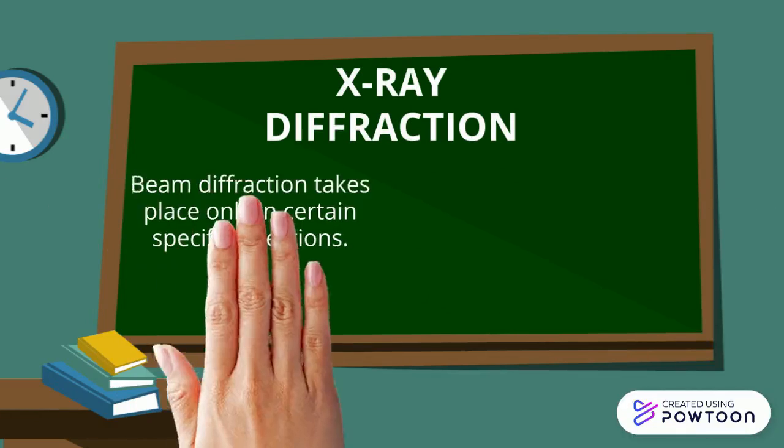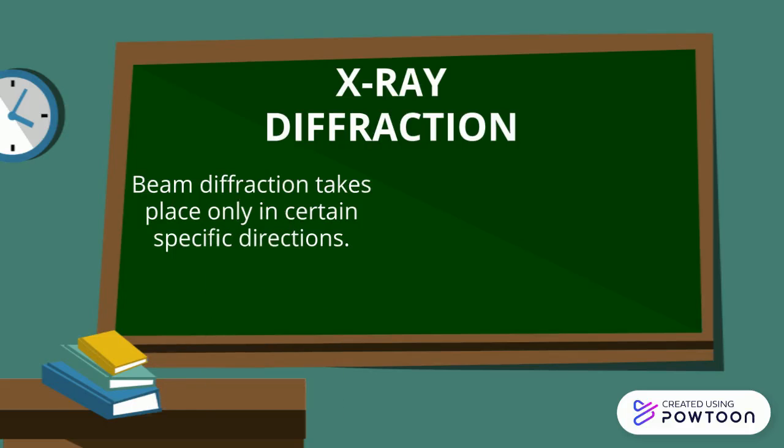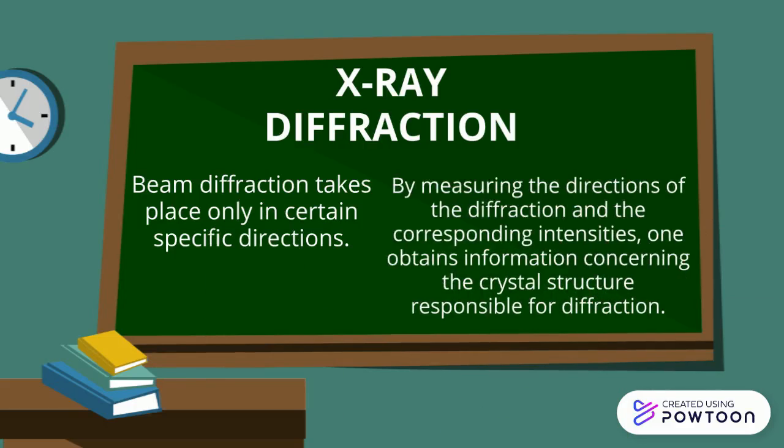Beam diffraction takes place only in certain specific directions. By measuring the directions of the diffraction and the corresponding intensities, one obtains information concerning the crystal structure responsible for diffraction.